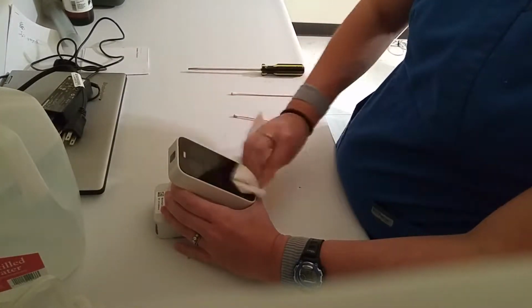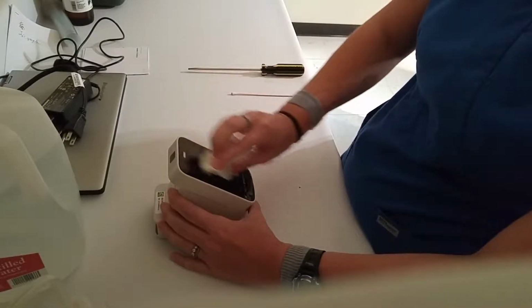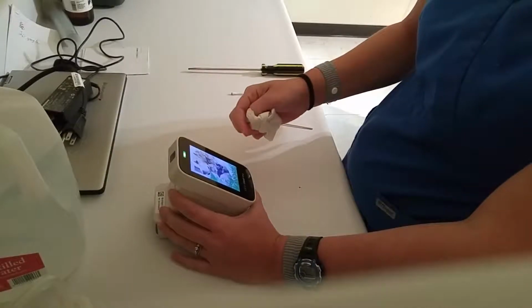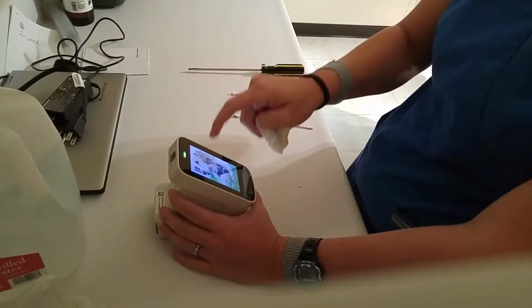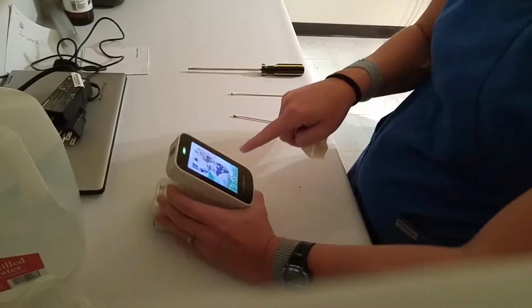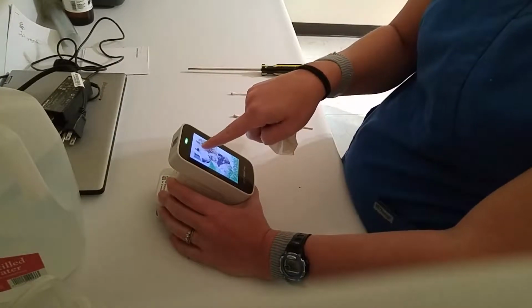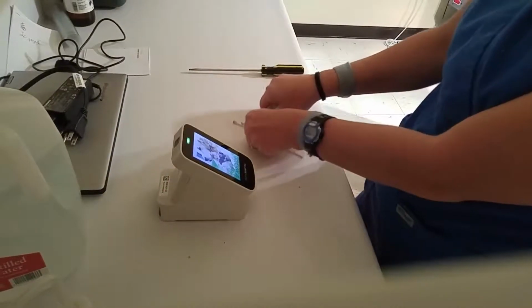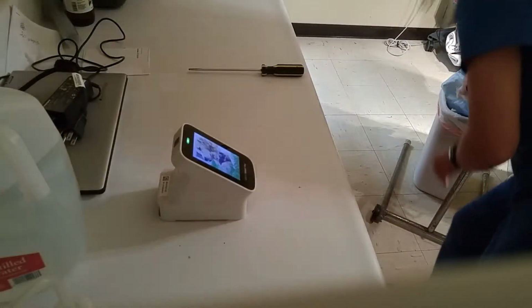And we want to make sure that the screen is clean as well. We don't want to mess up any of the calibration when it comes to pushing the buttons on there. We want to make sure that what we're touching is actually what's getting pushed, as opposed to maybe touching down here and actually hitting something up here. So it helps to keep the screen clean and keeps us from having to recalibrate the screen as often.